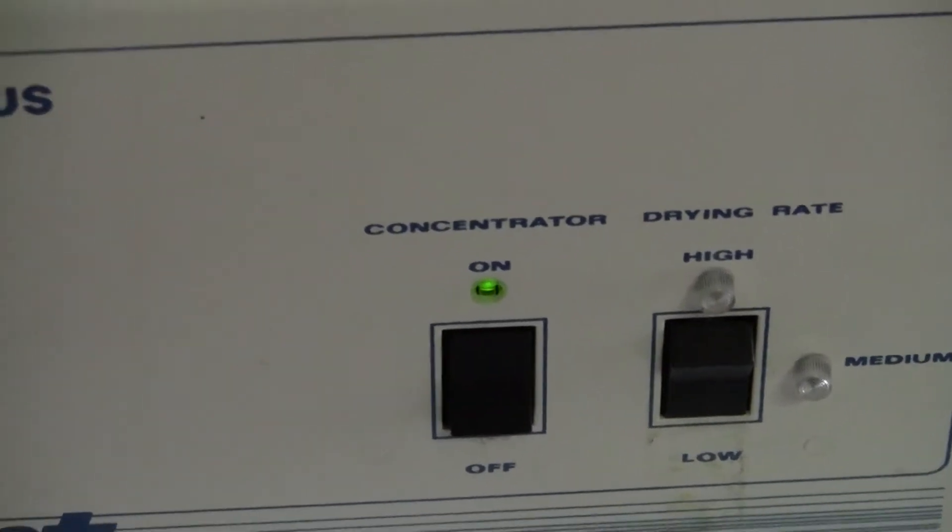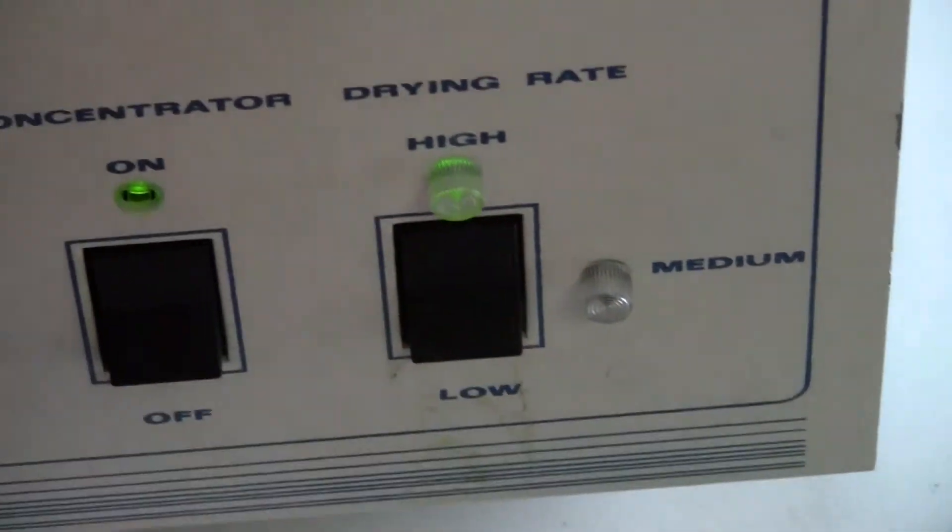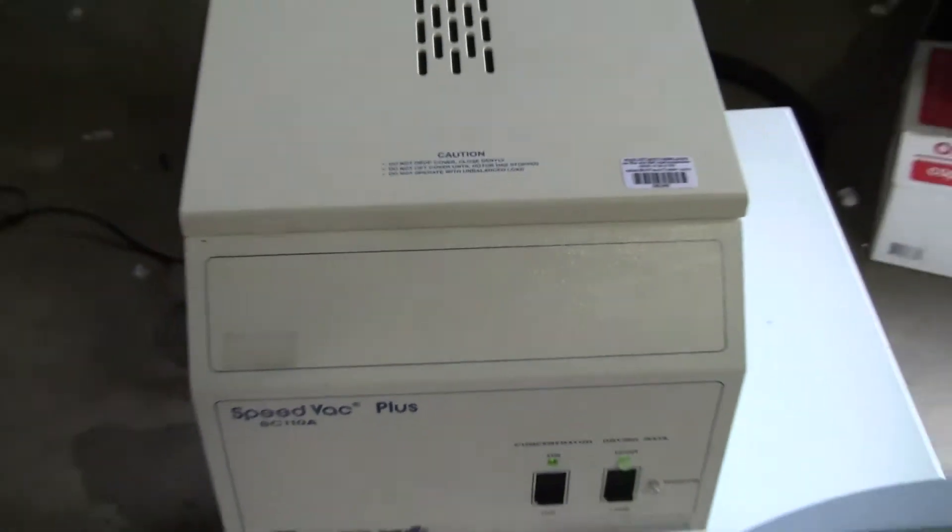Your drying rate, which is your heater, works. See the medium and high lights. Right now it is spinning quite nicely.